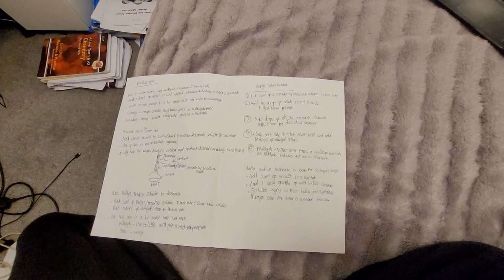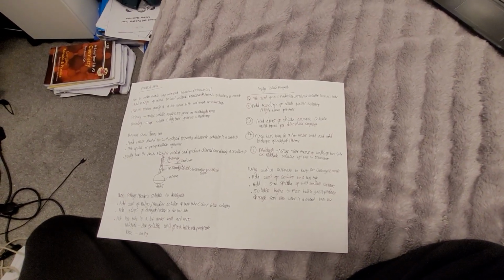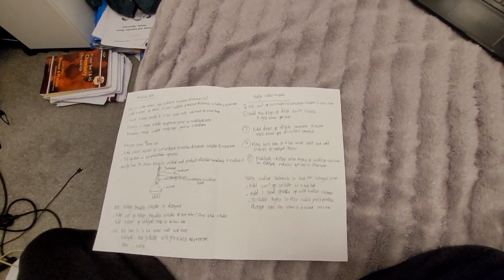Using sodium carbonate to test for carboxylic acids: add 2 cm³ of the solution you want to test to a test tube. Add 1 small spatula of solid sodium carbonate. The solution begins to bubble. Bubble the gas it produces through some lime water in a second test tube, and you should observe the lime water turns cloudy.